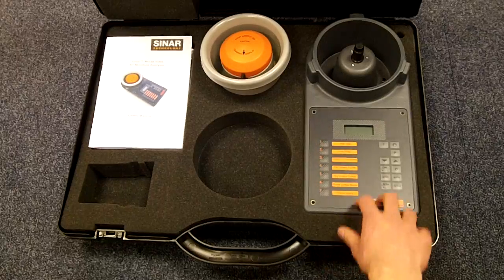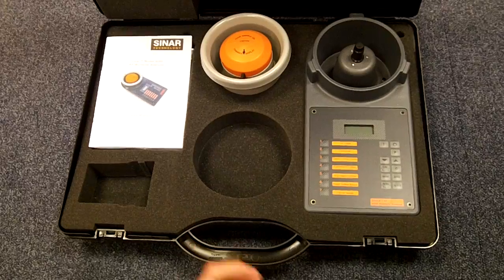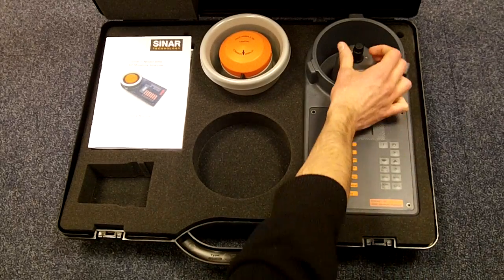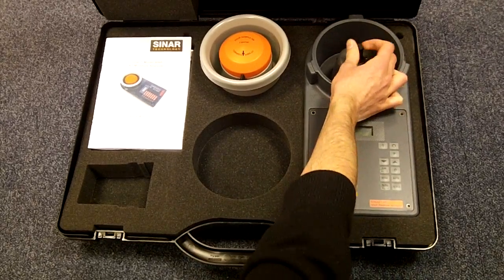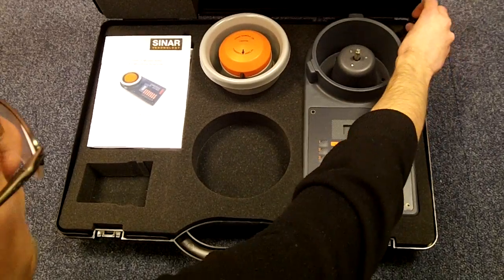On top of the instrument there is a weight balance retainer. This holds the weight balance in position in transit to protect it from vibrations. To remove this just unscrew the nut at the top. You can then store it in the hole in the carry case.